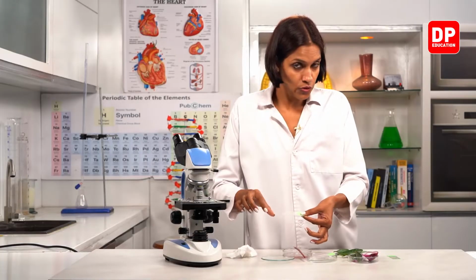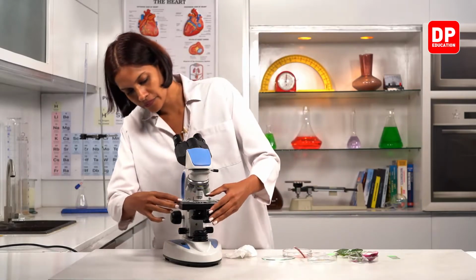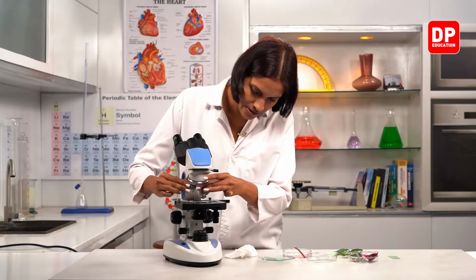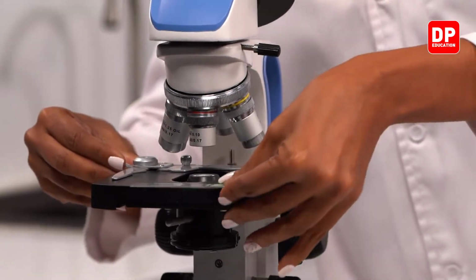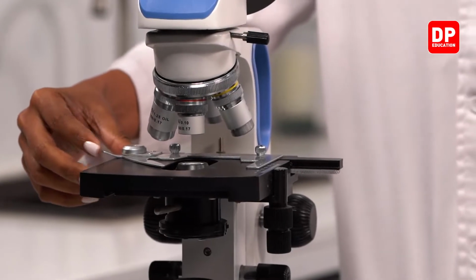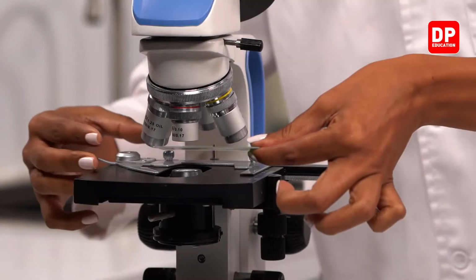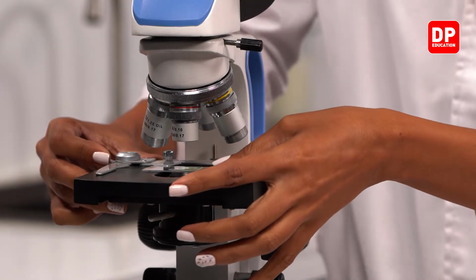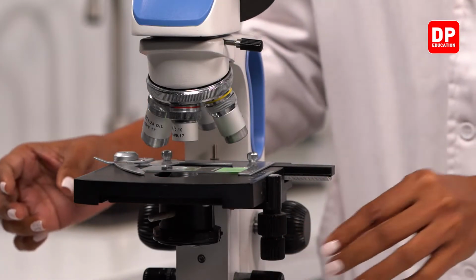Wipe off the excess water and we are ready to go. Turn this to low power so that you will not harm the lens. And then mount this one. Right.